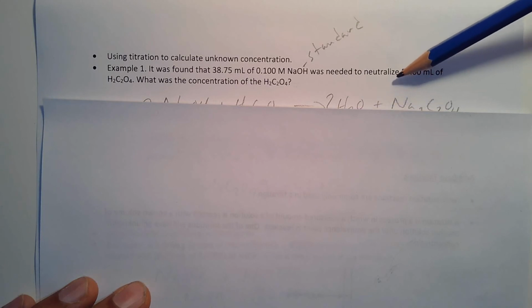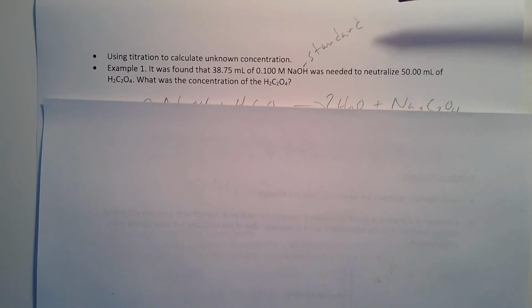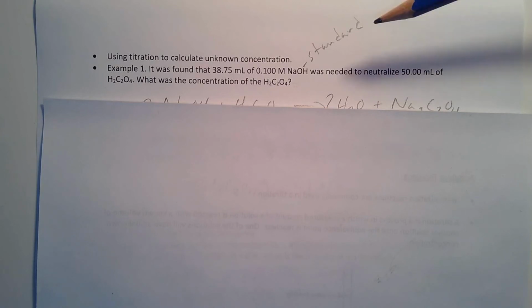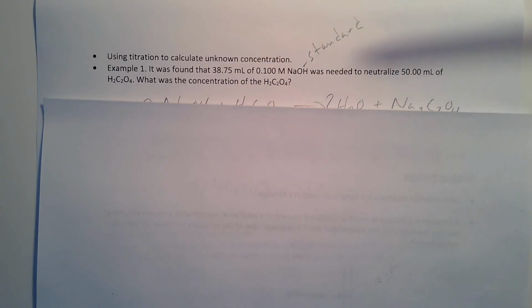That's why we know that this is the amount required for neutralization. Now, typically you would do several trials and then take an average. When you take the average, you discount any values that are off by quite a bit, so you only take the average from the values that are pretty close to one another.